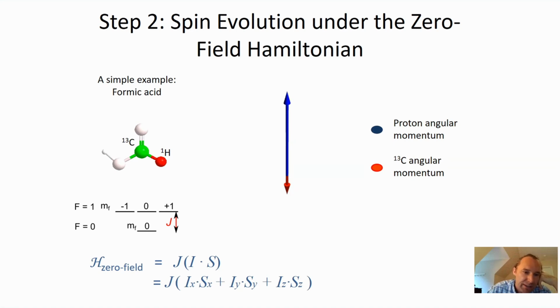221 hertz. So the difference between these states, the triplet states, and the bottom, which is the singlet states, is on the order of 221 hertz. And that's the oscillation frequency at which these two magnetization vectors keep exchanging and which fundamentally produce the magnetic field that we detect.